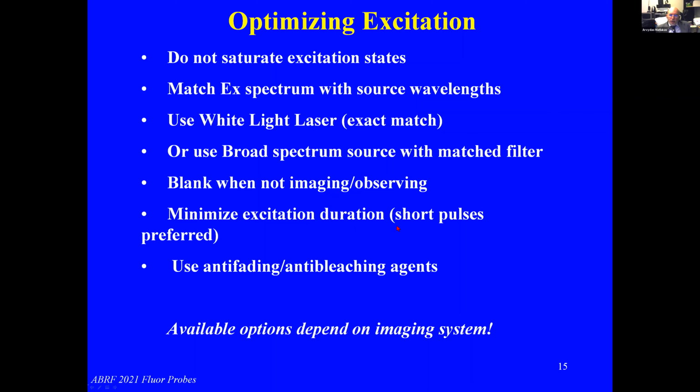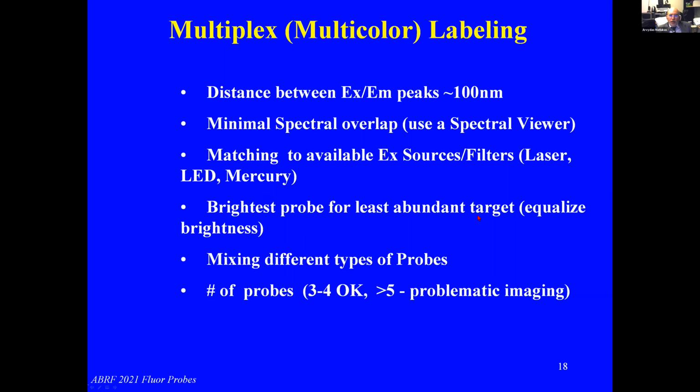It is advised to equalize as much as possible the fluorescent signals of different probes, so it is recommended to use brightest probe for the least abundant target.